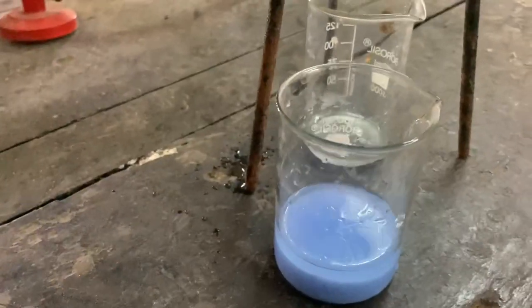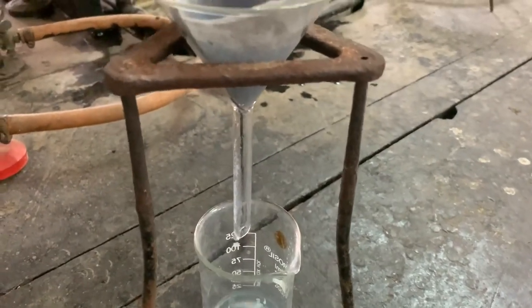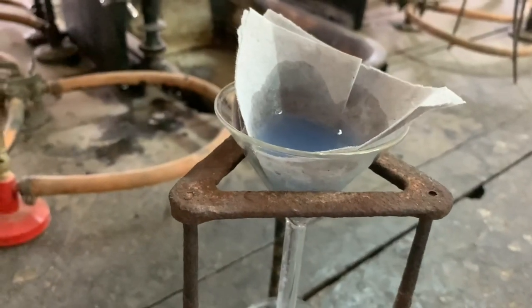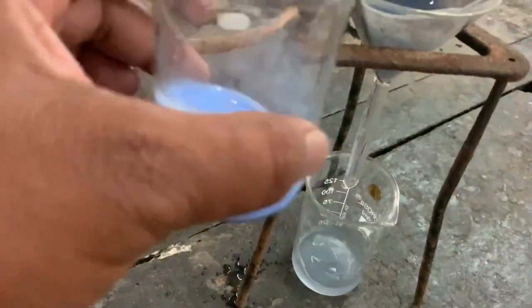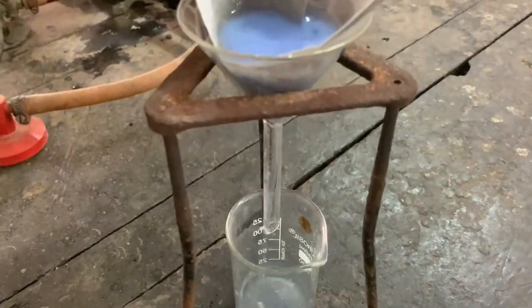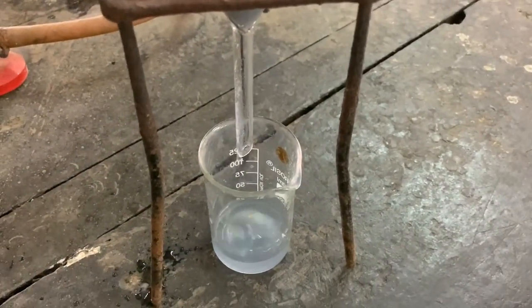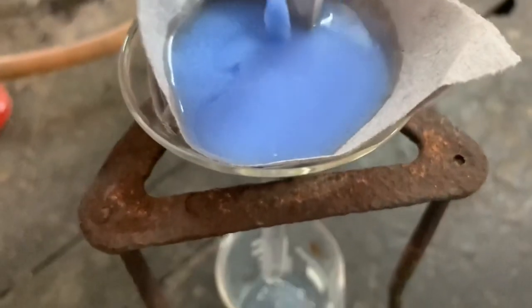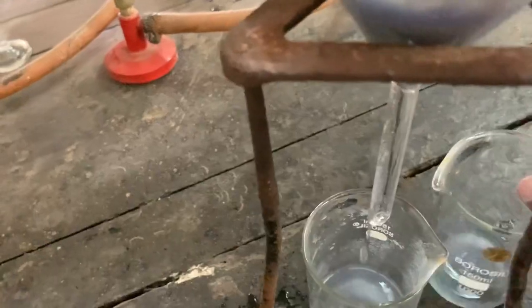I use filter paper. So the complex is now collected here in the filter paper. At the bottom we have a lot of complex. We'll transfer it to the filter paper carefully. Complex is collected here. Okay, we'll wash the same beaker with the same filtrate.